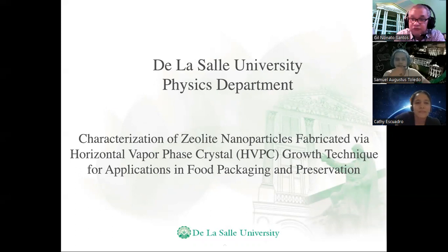This one is the first for our research lab to do food packaging research, where the zeolite is placed inside the food package. If they want to really pursue this material, because in this research we spoiled the milk and then we poured it in the tube and then counted the colony forming units.